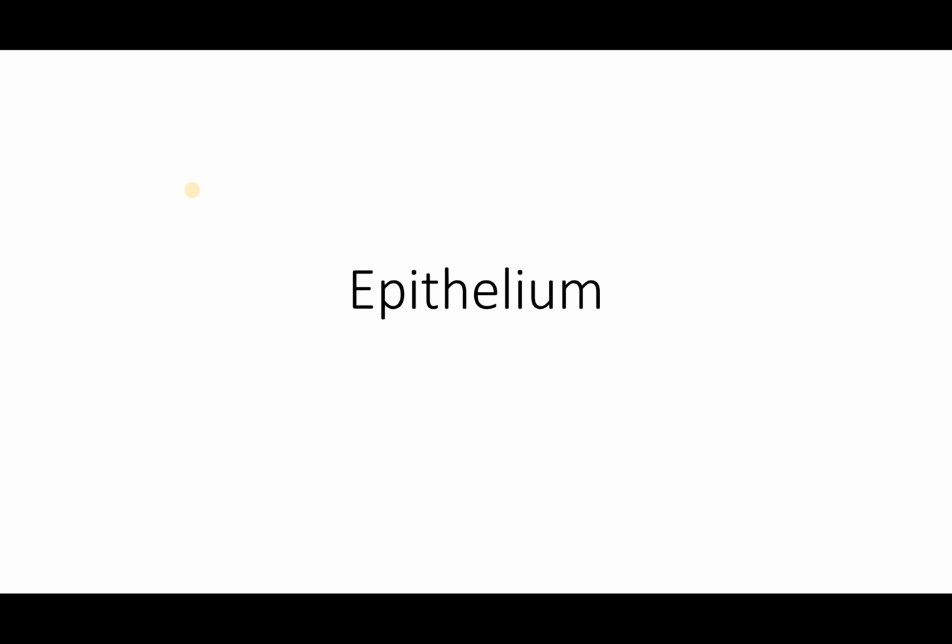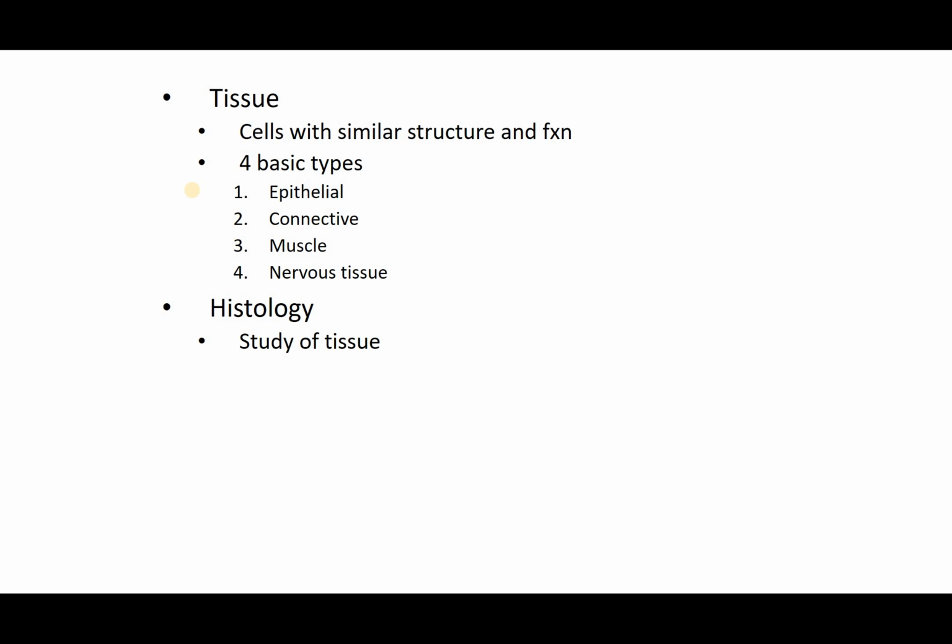In this section, epithelium is covering, so these are going to be histology slides of the epithelial tissue. Later we'll look at connective tissue, muscle, and then nervous tissue.